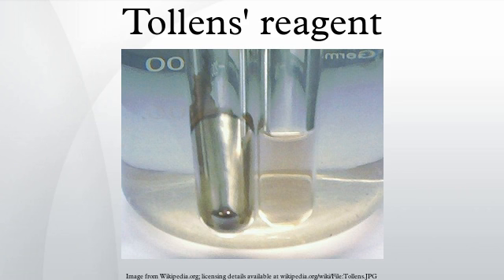Laboratory preparation: this reagent is not commercially available due to its short shelf life. It must be freshly prepared in the laboratory. One common preparation involves two steps. First, a few drops of dilute sodium hydroxide are added to some aqueous silver nitrate.